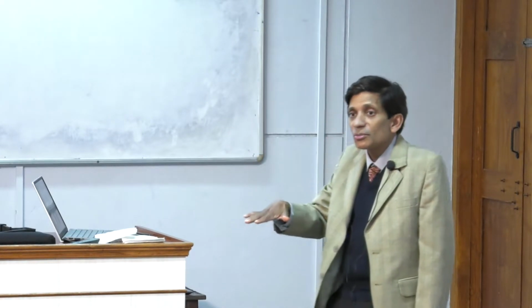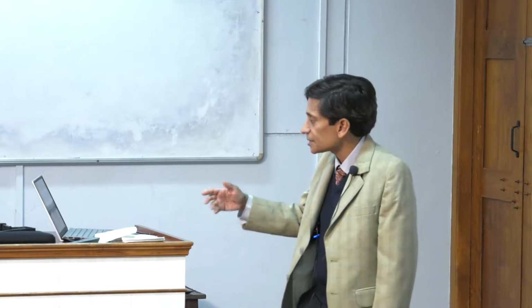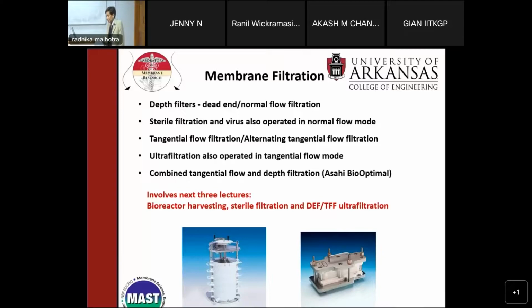In the case of normal flow, this is typically one-time use only. You never regenerate normal flow filters. Depth filters are used once and then typically you throw them away. It is really very difficult to regenerate them. In fact, you use normal flow when you don't want to regenerate, because tangential flow is just more complicated to run, as we'll see later.